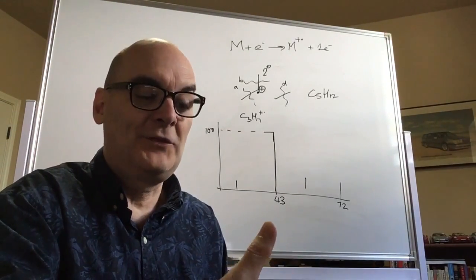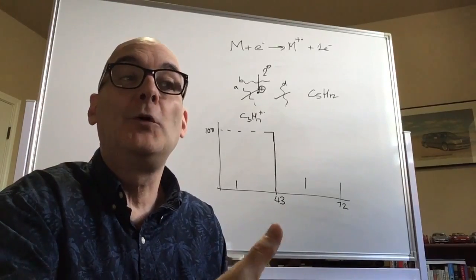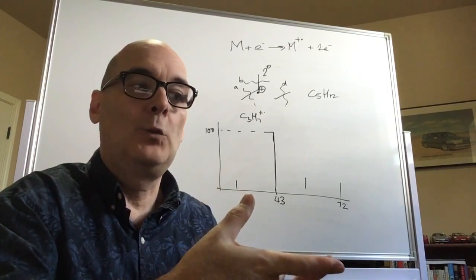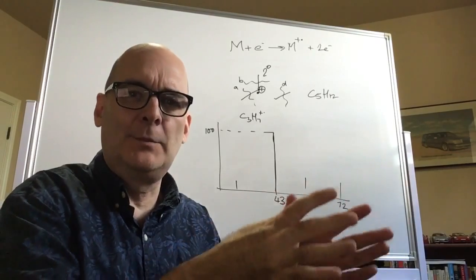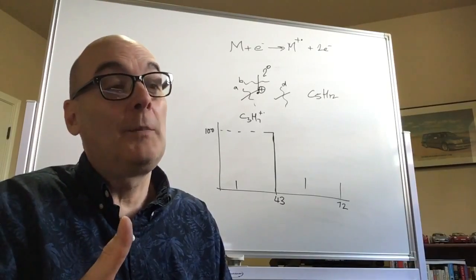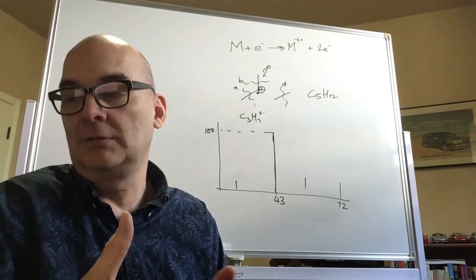They might contain sulfur. They might contain chlorine or bromine. Chlorine and bromine both have distinct isotopes that will show up as repeating little motifs in the fragmentation pattern. Okay. And a molecule might contain nitrogen, and there is a little twist with nitrogen.